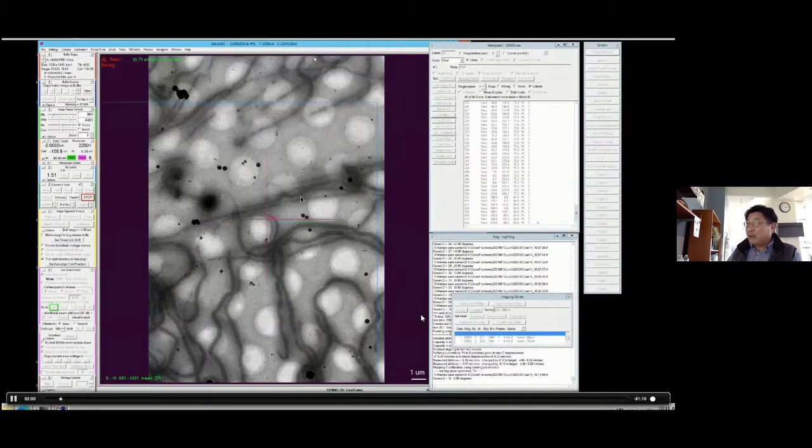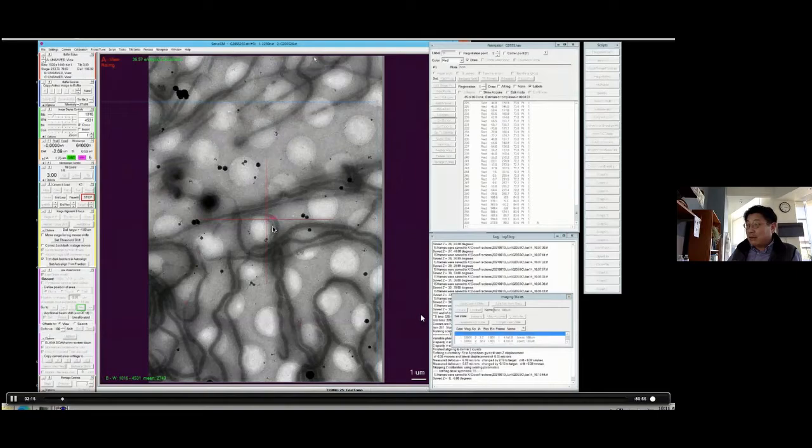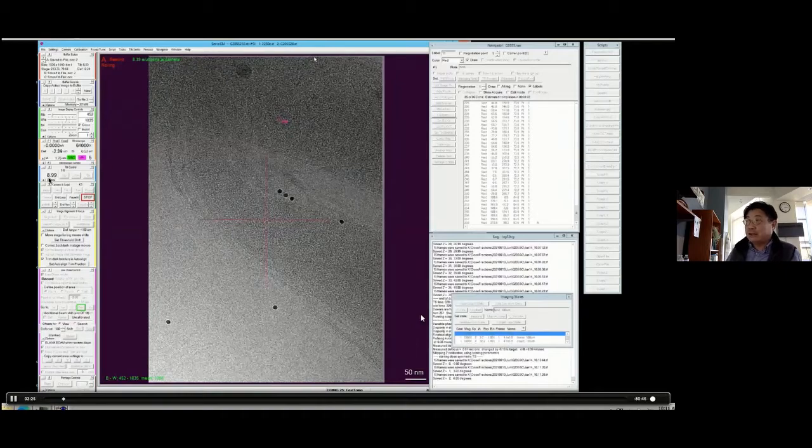And then they go back to low mag. After tilting to 3 degree, they use low mag to do tracking in order to minimize the dose. So now they do the tracking, and go to 3 degree. Instead of doing focus and tracking, they now directly collect the image, because that speeds up the process.